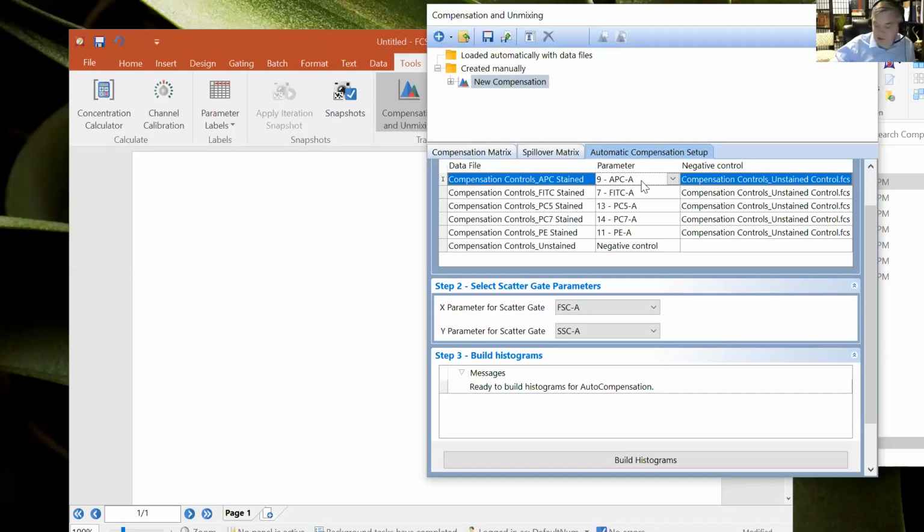Yeah, and then my second comment that I'll just say very quickly is sometimes the parameter names on the instrument don't actually reflect the fluorochrome. You might run into a circumstance where the instrument that you're working on might say BB421 and the actual compensation control says DAPI or something like that. They don't always match up with the naming, but as long as you understand this is the correct detector. Thanks, Sean. Yeah, no problem.